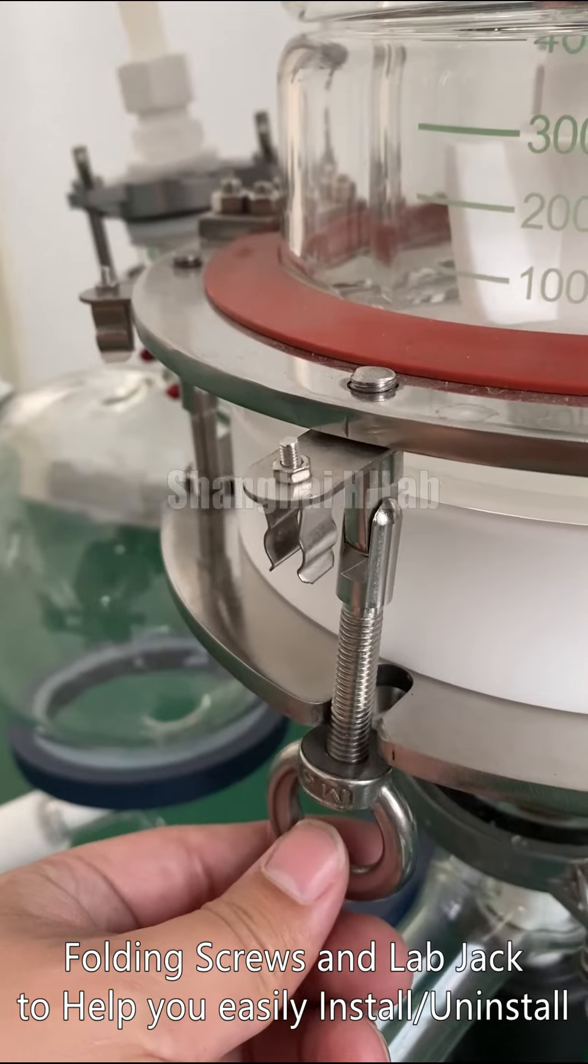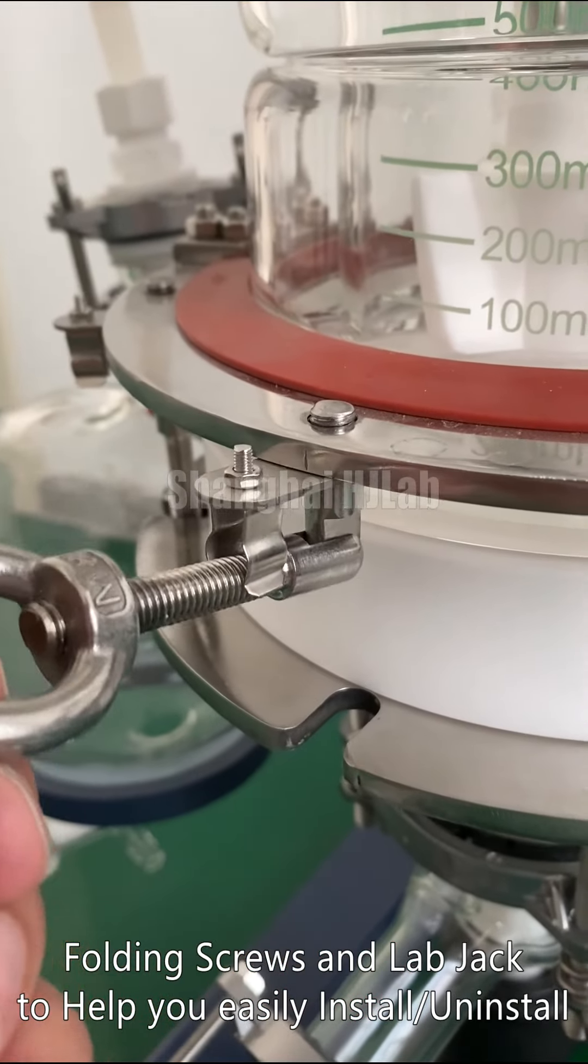Folding screws and lab jack. Folding screws and lab jack operation, so easy.